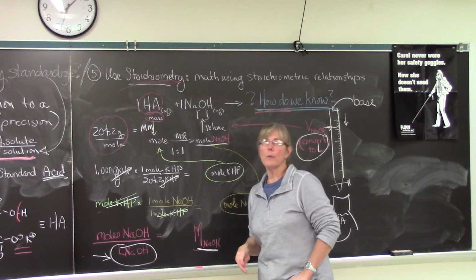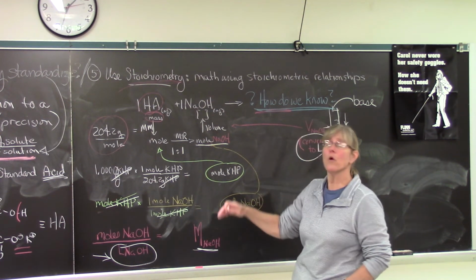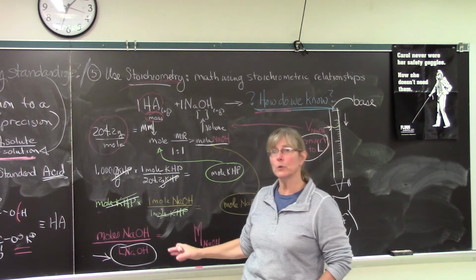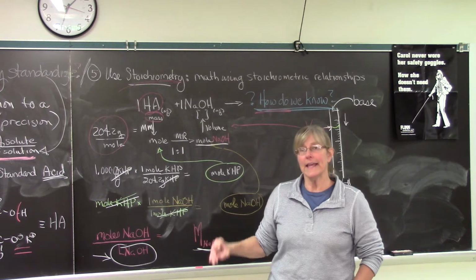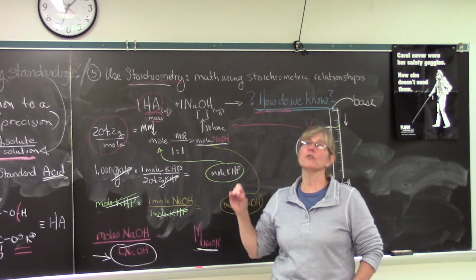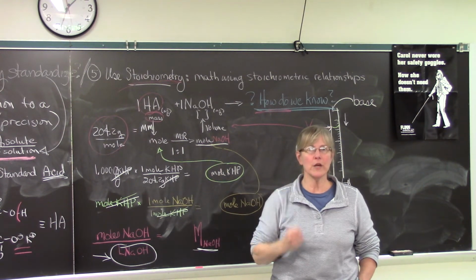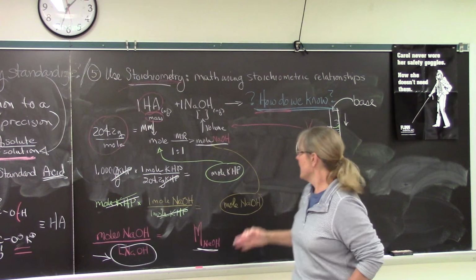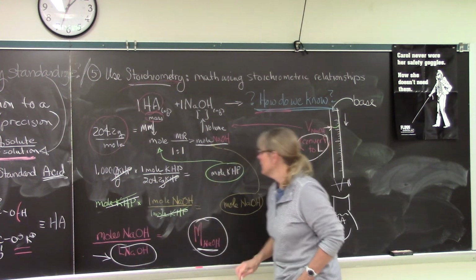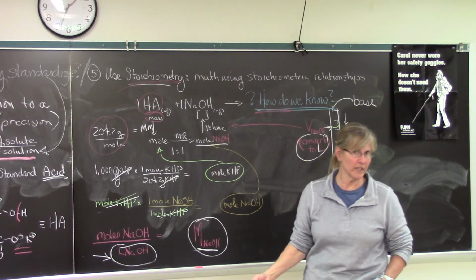Don't worry, we're going to go back over the calculations before you actually pass this in. But you're going to have to be able to do these calculations in lab, because you're going to have to keep doing these titrations until you get 3 that are really close in the molarity.